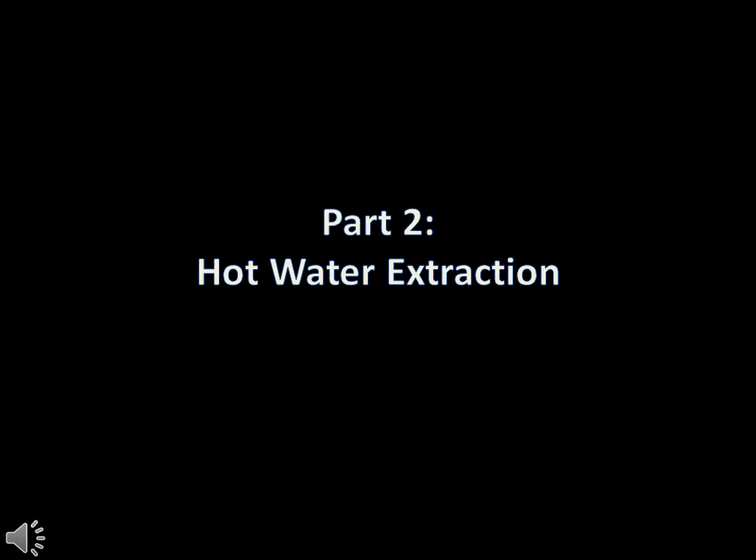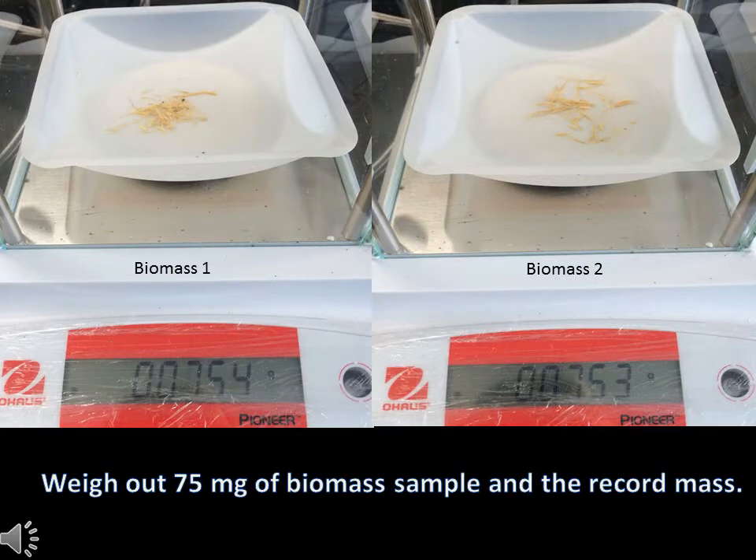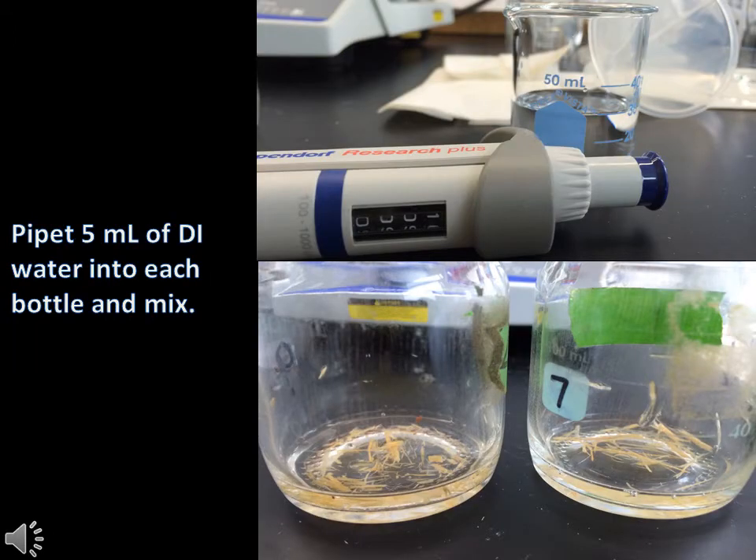Part 2: Hot Water Extraction. Begin by preparing a hot water bath by filling a large beaker with 200ml of tap water and placing it on a hot plate. Turn the hot plate up to a maximum setting to quickly bring the water to a boil. Grab two weigh boats and your unknown biomass, weigh out 75mg of the biomass sample onto each weigh boat and record the mass. Transfer your weighed biomass samples to suitable containers for boiling — either a test tube or other glass bottles. Pipet 5ml of DI water into each test tube or bottle and swirl to mix thoroughly.